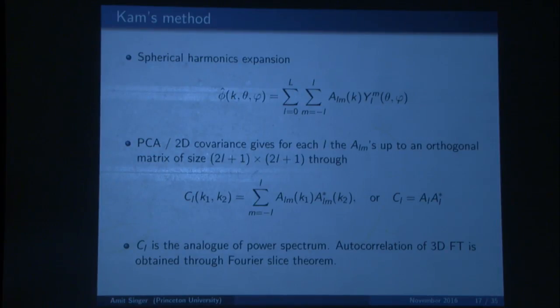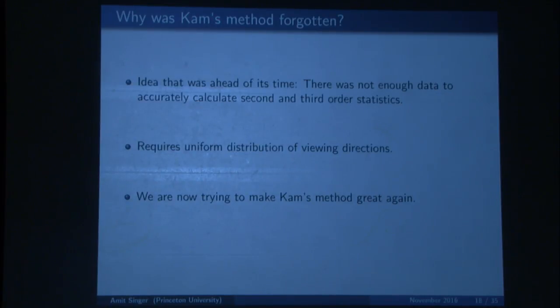So there is an issue, okay? In cryo-EM, you cannot really take any three frequencies because they must be supported on a plane. Otherwise, it's not like you see the whole 3D volume. So you can only take three frequencies on the same plane, and then also you have this averaging process. So it's not clear, right? I mean, we're working on this, if it's actually invertible, like we have in the 1D case. Okay, so you can ask.